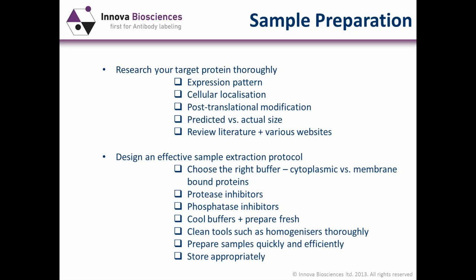And therefore, if I hadn't been aware of this at the time, it could have resulted in me taking what was a very nice Western blot and scrapping it and going back to the design board to try and understand what was going on. All of this can essentially be avoided by doing your desk research to thoroughly understand where your protein is. And then we move on to the extraction.